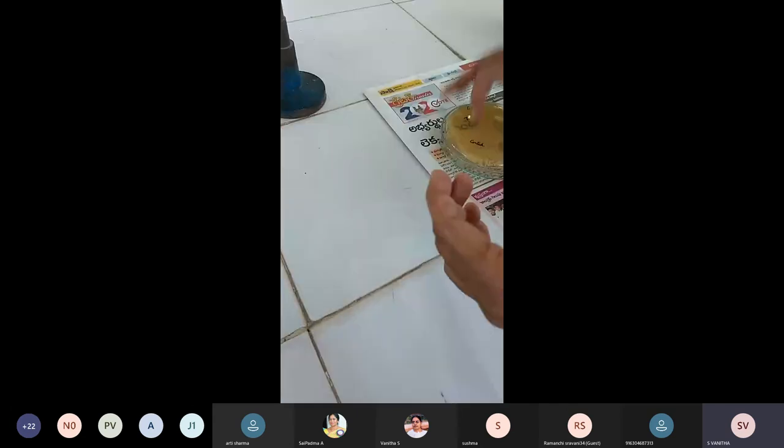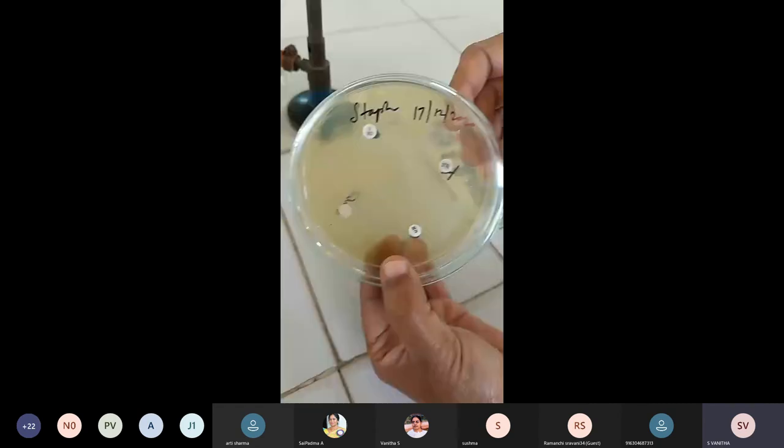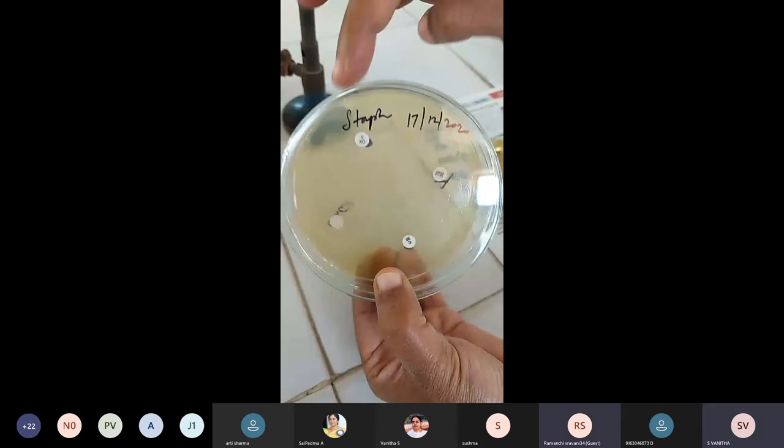Now I'll show you another sample. See, this is another one. What is this? We are able to see the labeling. Yes, ma'am.